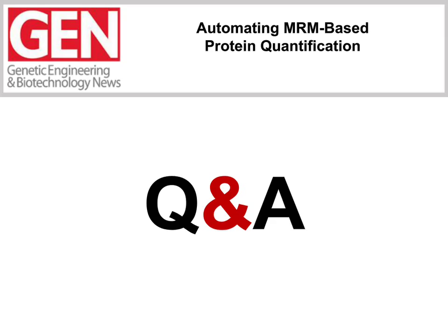All right, and I think for our next question, Tasso, someone wants to know, can the micro cartridges be reused? We have not really tried this, but maybe you can reuse them when you're doing method development. Possibly, we have performed consecutive elutions of the micro cartridges, and they are very clean.